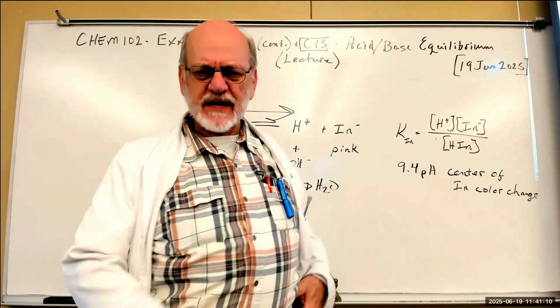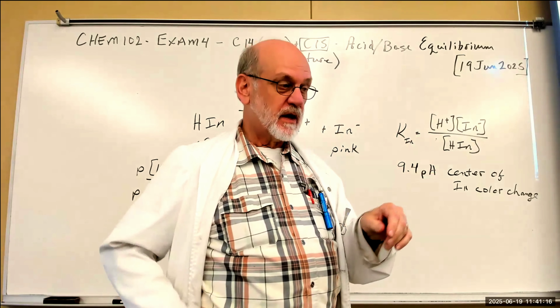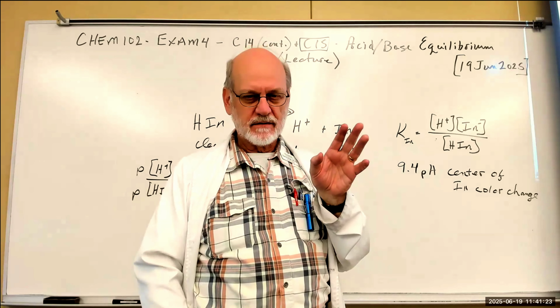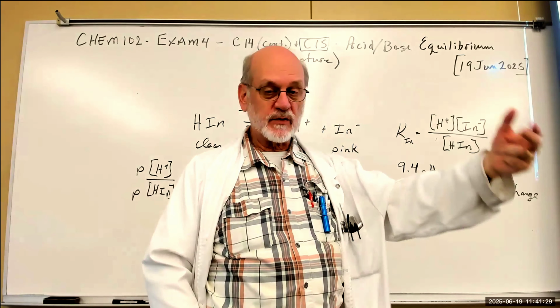And that works best for this type of lab because we're going to do a number of different reactions. We're not going to focus on just one reaction. Our focus is going to be on what have we done to change the reaction, and notice the effect and relate that to LeChatelier's principle.